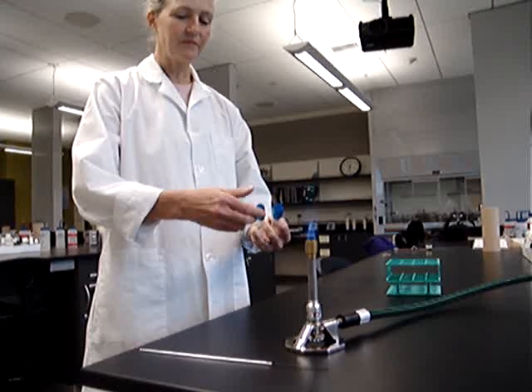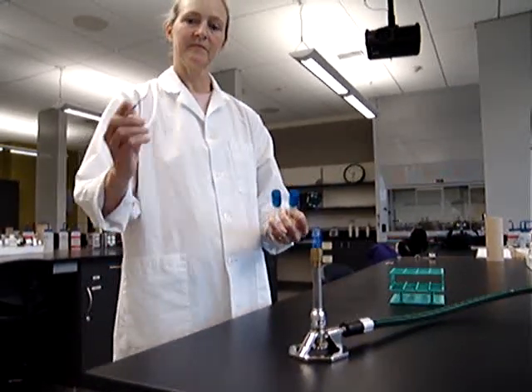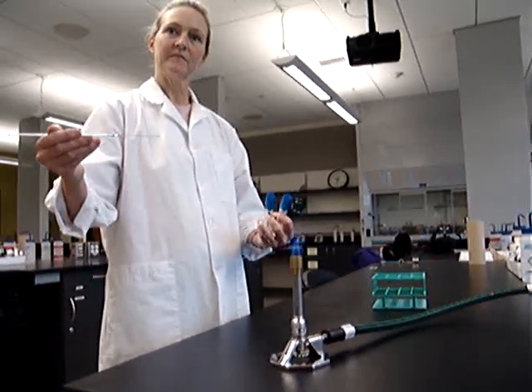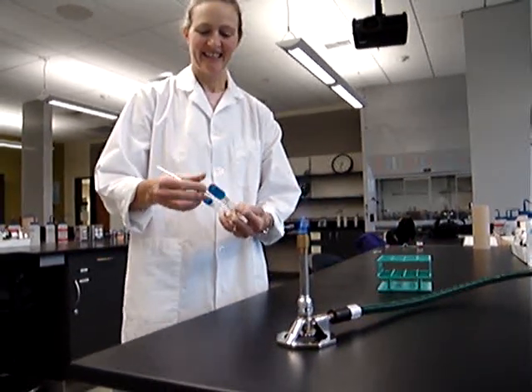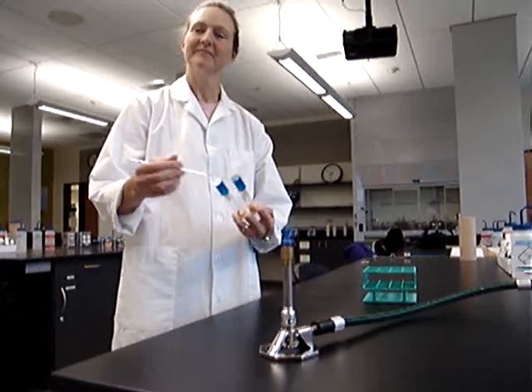So Kerti, go ahead and pick up your loop. Did you go ahead and loosen your cap? There we go — caps are loosened and ready for transfer.